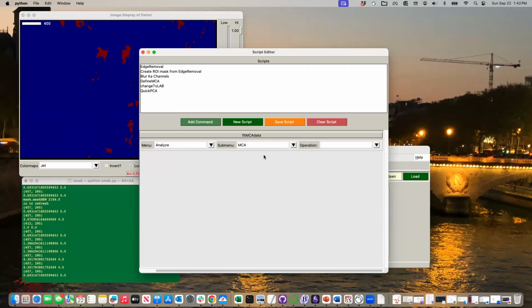Too many things that end in A. PyMCA even was what I want, right? And I could load a file, whatever the name of, like, my favorite MCA fit that you saved from that save button, right?